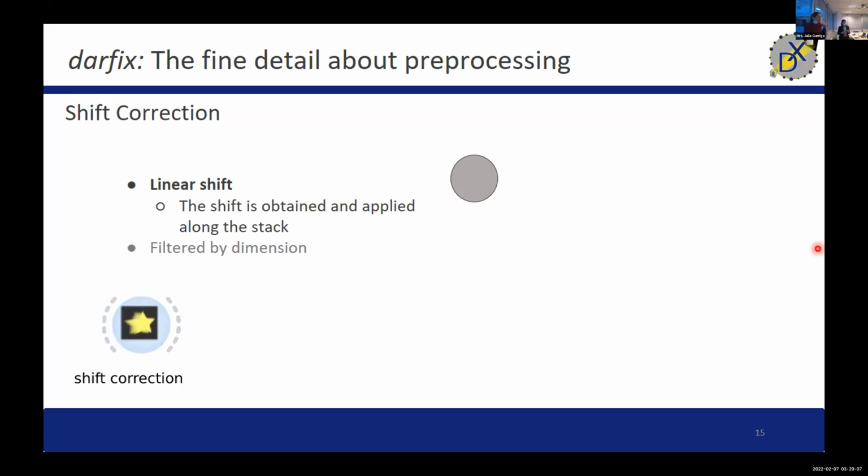Aside from this, sometimes the data overlaps when you have treated one dataset twice. How long have you had the version you have now? How long since you last updated Darfix? I updated Darfix last week on Tuesday, so somewhere in the last 2 weeks. Okay, then it's not from 3 months ago. That's good to know already.